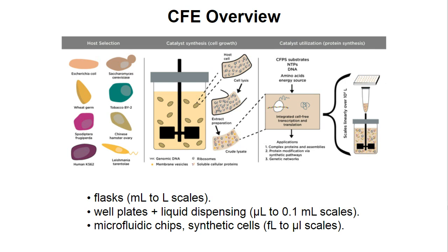The cell-free gene expression system is also composed of other solutions: an energy mix containing the ribonucleosides, such as ATP and GTP for the energy, and an amino acid mixture that contains the 20 canonical amino acids, and other cofactors, such as molecular crowders, like PEG or Ficoll, and of course, your DNA prepared using standard procedures.